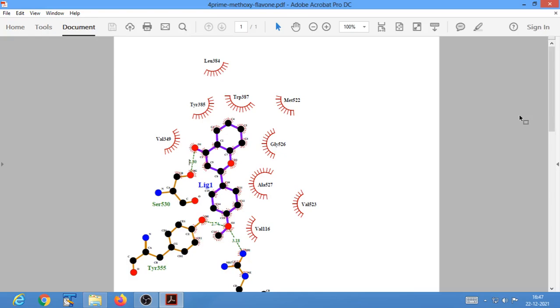So in today's demonstration, I will show you how to generate those beautiful graphic images that represent your protein-ligand complex in 3D. Well, this is the two-dimensional representation. We would be using the PyMOL software for generating these three-dimensional publication quality images.